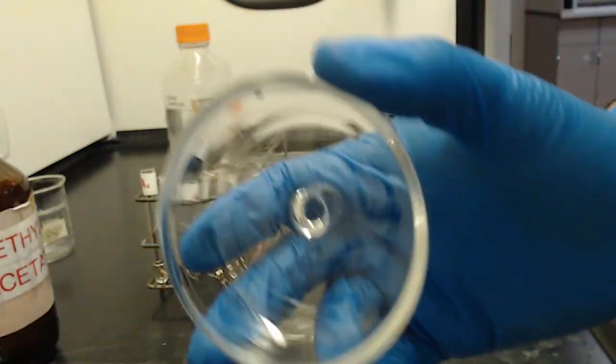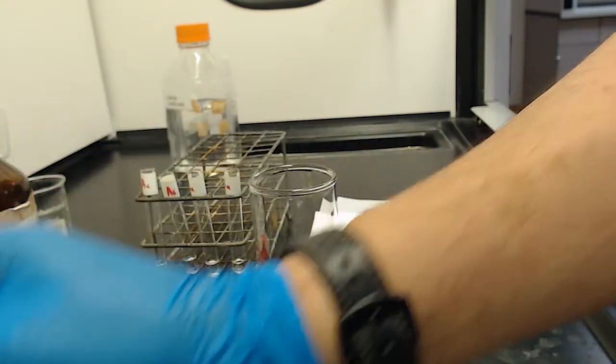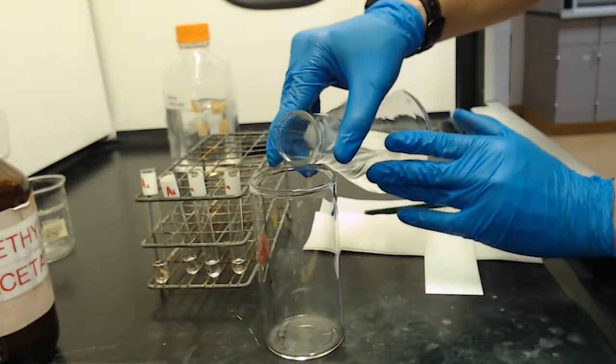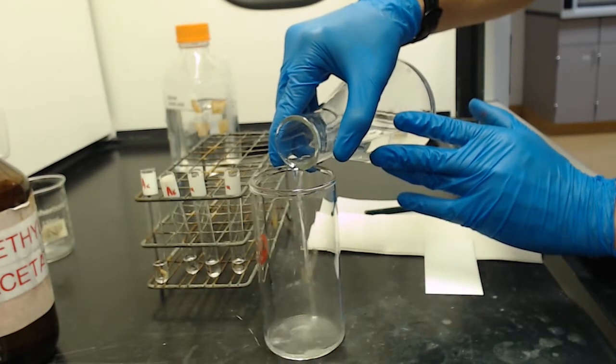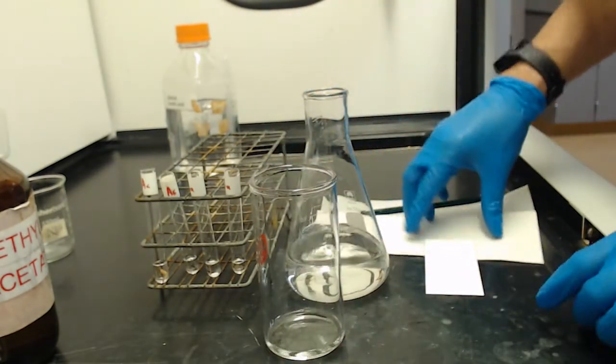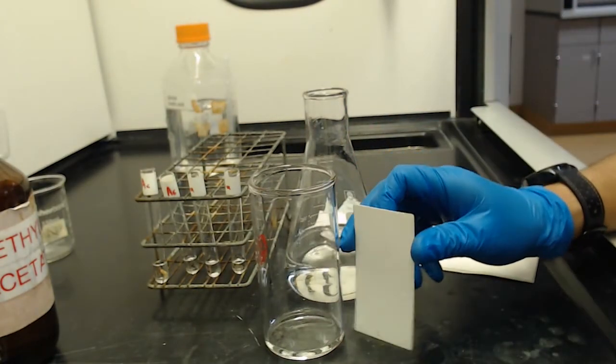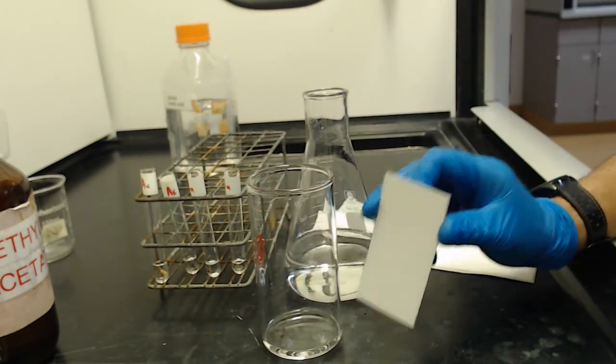The lid is necessary to keep things from evaporating prematurely. Okay, check if that is high enough. It might be too high. Nope, I think we're at a good height there.